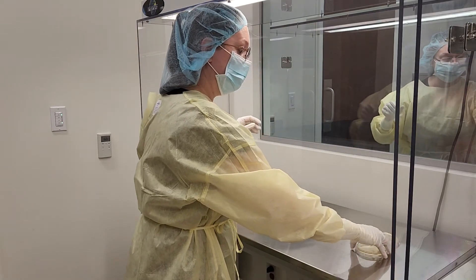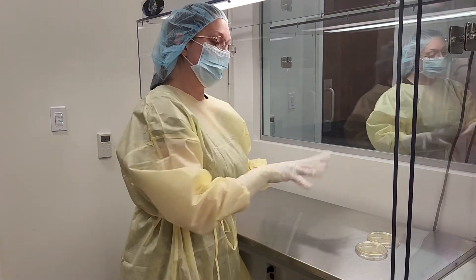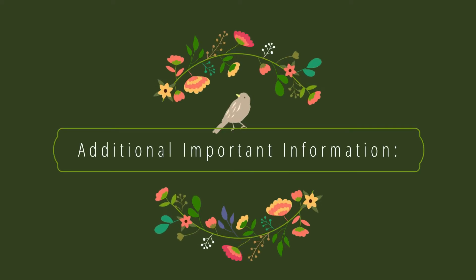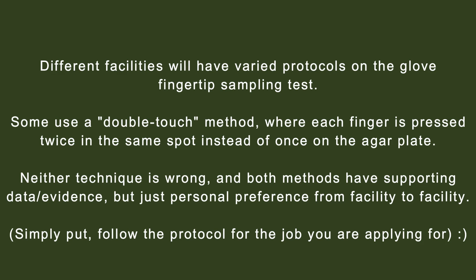This is now going to be incubated at a higher temperature for 48 hours, then five more days at a lower temperature. Do not touch the metal.